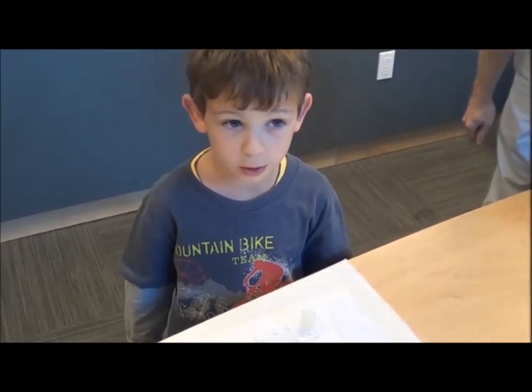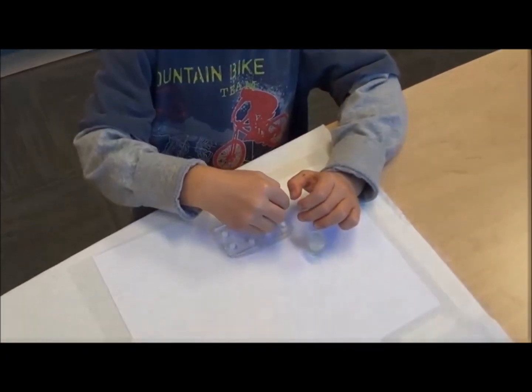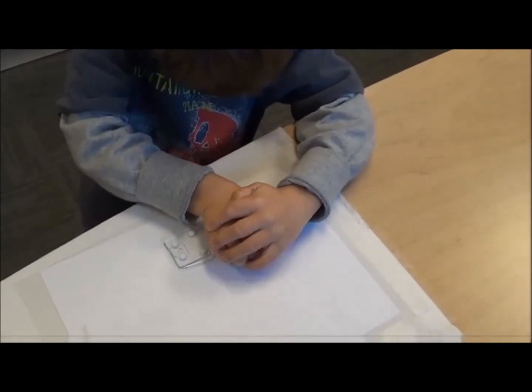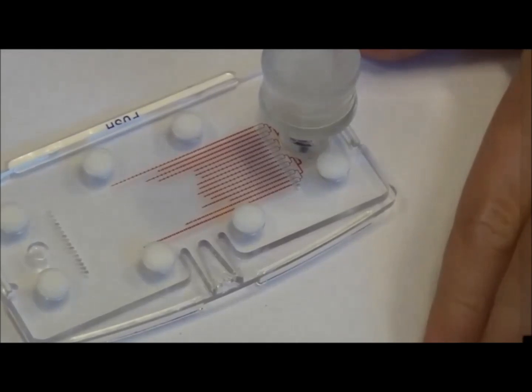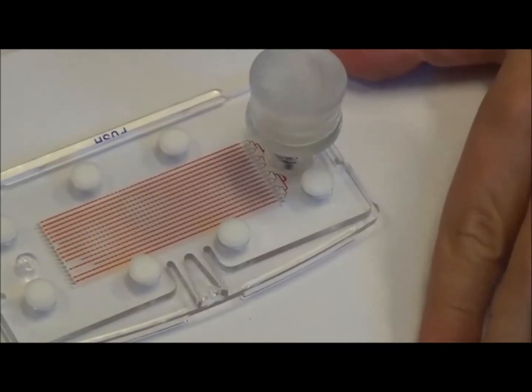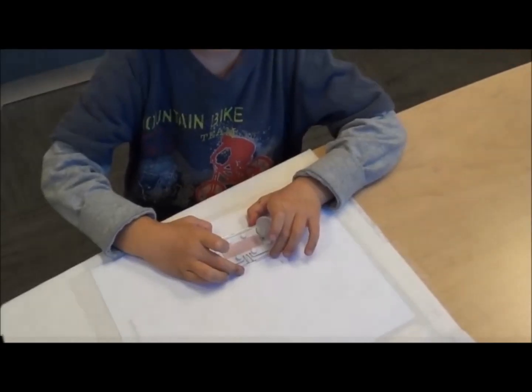This is how you do a slip chip experiment. First you get the sample, then you put it in a hole. Then you cover it with the top. Then you wait until it goes to the end. Then you slip. And now it's done.